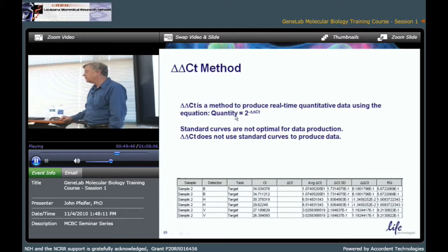An absolute number: if I was to determine the absolute number of genome equivalents in that sample, I would also translate that to the number of genomes per cell, because I know the number of cells. So I guess you could probably arrive at the two. That's what I'm trying to achieve. Yeah, both are possible.